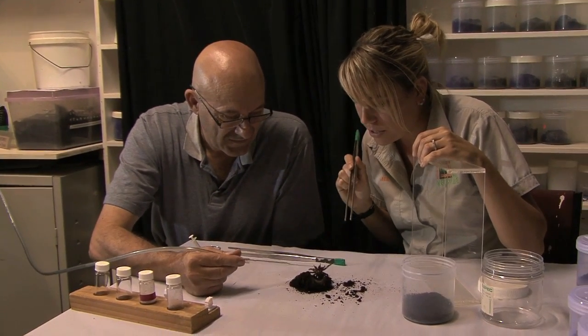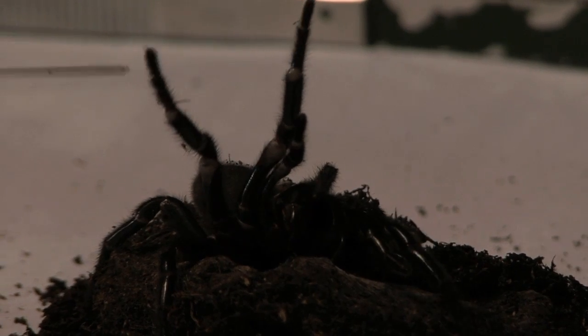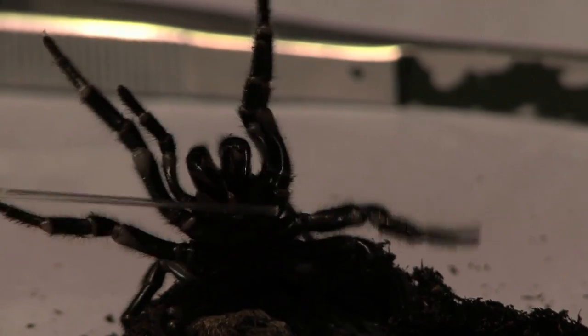Come on, there you go. You've got a big one right there, and then a little bit on this fang. Come on, what are you doing, miss? You're all right. You can feel them actually attack the end of that pipette, and she has the ability to snap the end of that pipette if we're not careful.